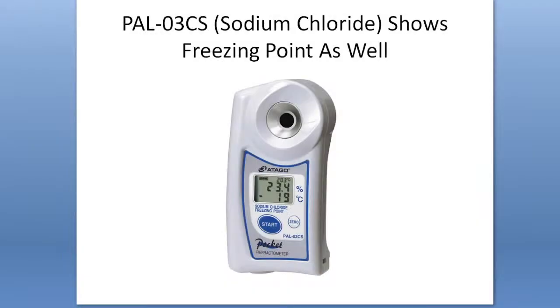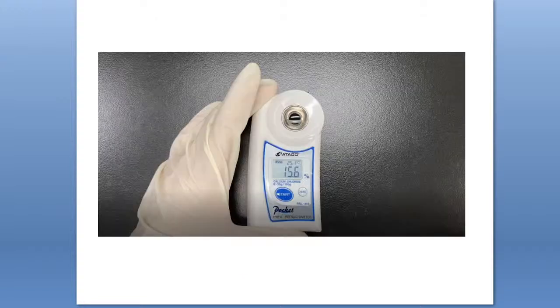So, moving back to the presentation. Today I prepared 20 grams of de-icing fluid, calcium chloride, and 80 grams of water. So you might think that it should read 20% for this instrument, but the measured value is actually 15.6%. This is because the sample's purity actually affects the measurement. I checked about this sample's purity with the Japanese manufacturer, and they said it's not really pure. Only 75% is actually calcium chloride, but other components are mixed in with that. But they just assume that all of the components are calcium chloride. So that's why this instrument reads 15.6%, not 20%.